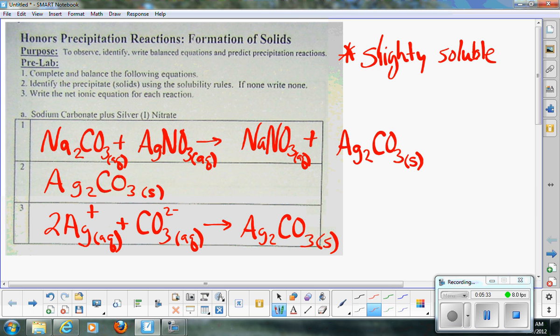If you don't see it, you know why. But if you do see it, you know why. There's also going to be what they call moderately soluble. And you want to do a key for that, maybe a triangle or a square or something. I probably wouldn't use a circle because you might think it's oxygen. But find some kind of symbol that you can use to indicate it's moderately soluble so you have that same issue.